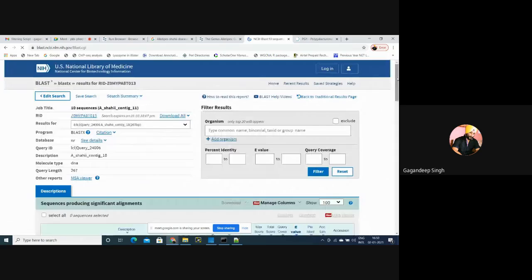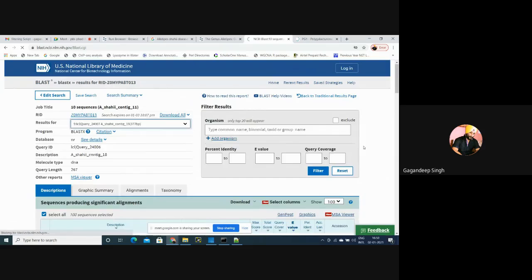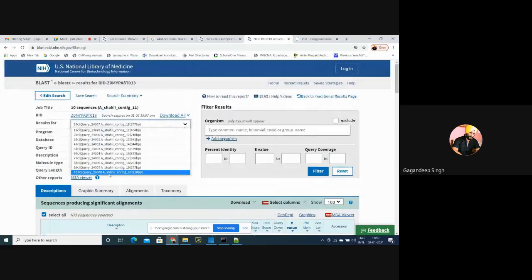How to find the differential gene expression by using CLC Workbench? I'll try to find it here. If not, then I need Linux, using Bowtie or other software which is freely available.